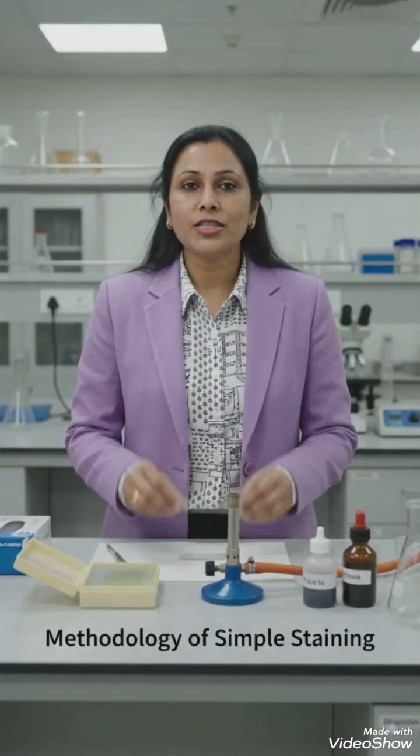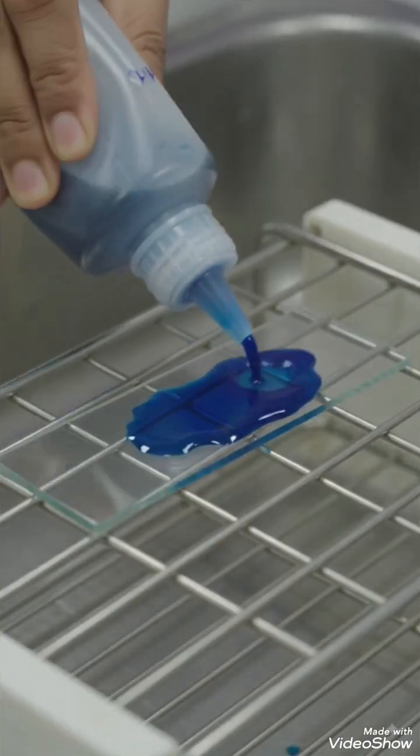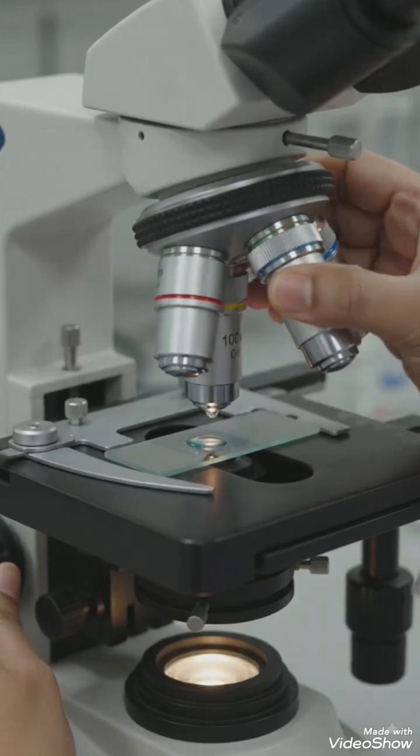Simple staining includes Step 1. Prepare thin smear on clean slide. Step 2. Air dry. Step 3. Heat fix the smear. Observe under oil immersion microscope.